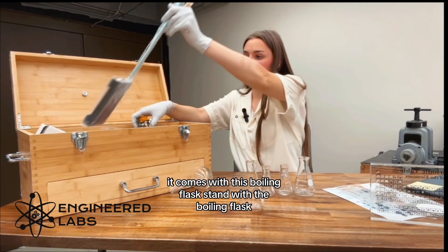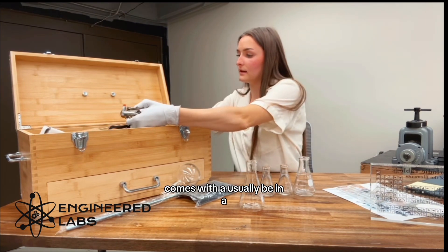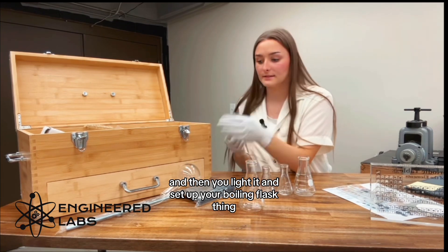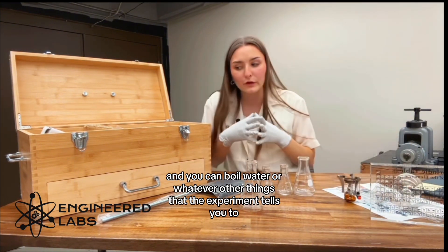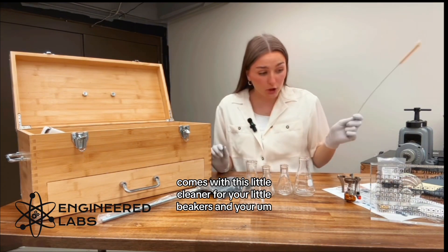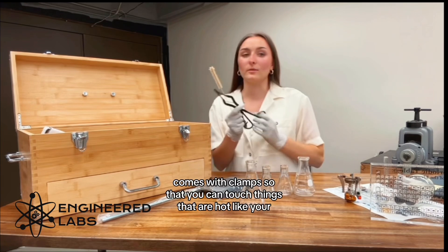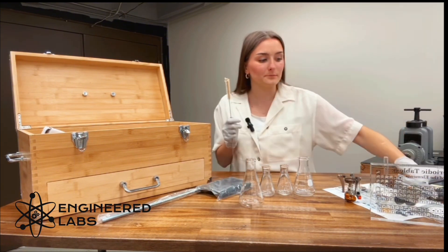It comes with this boiling flask stand with the boiling flask. It also comes with — this will usually be in a case — a butane burner. Just get your little butane tank and you screw it right on there, then you light it and set up your boiling flask, and you can boil water or whatever other things that the experiment tells you to. I've already used these, but these are the chemoluminescent mixture bottles.